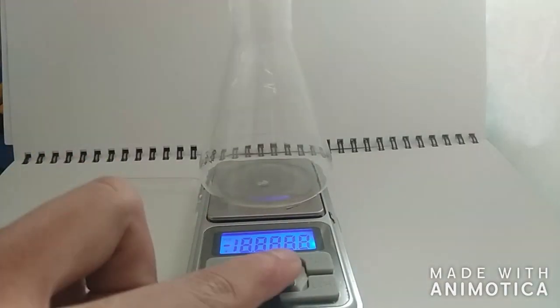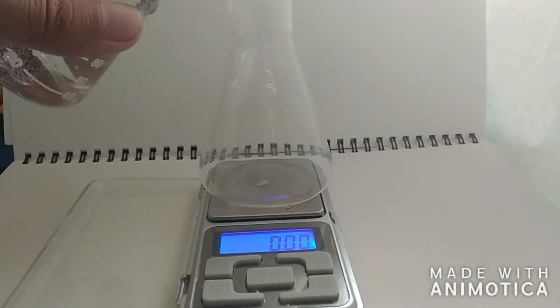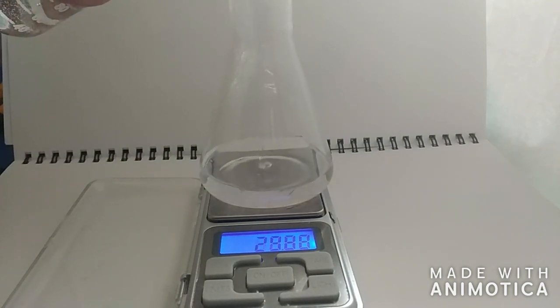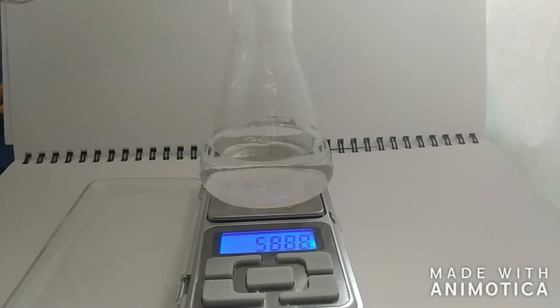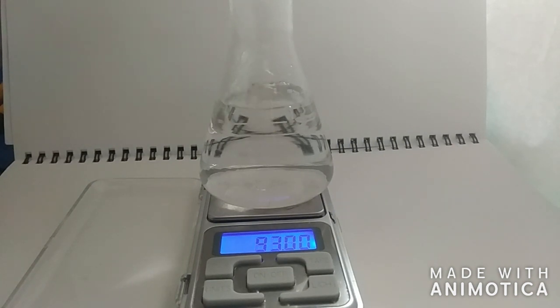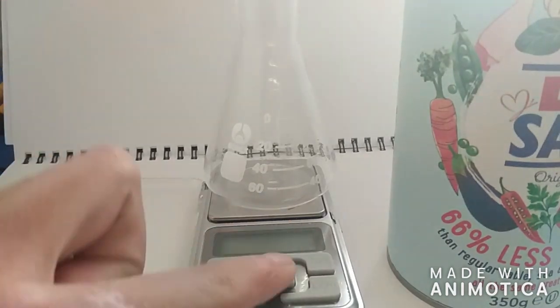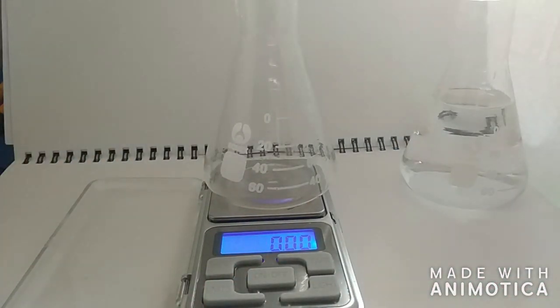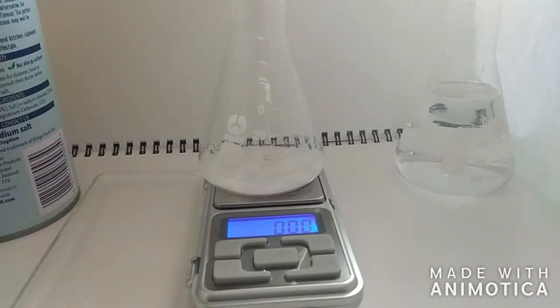So first we are going to weigh about 100 grams of water and 54 grams of low-salt, which is comprised of 66% potassium chloride and 33% sodium chloride and 1% magnesium carbonate as an anti-caking agent.